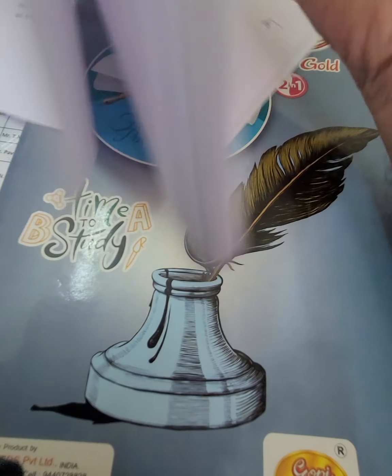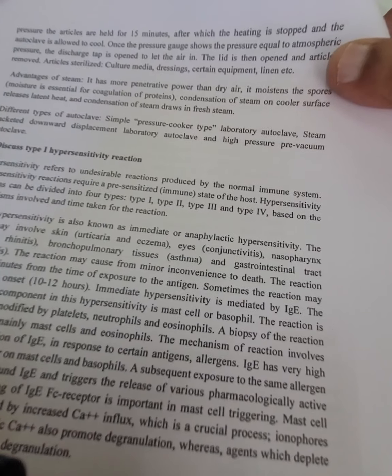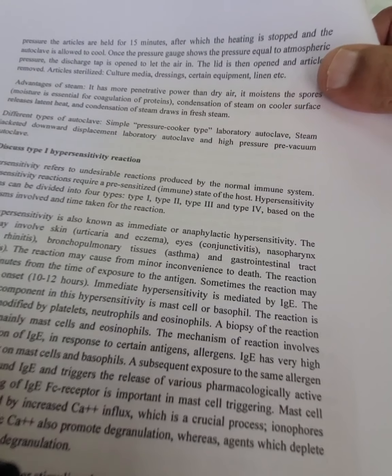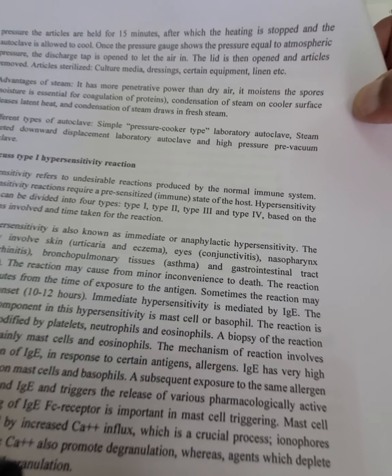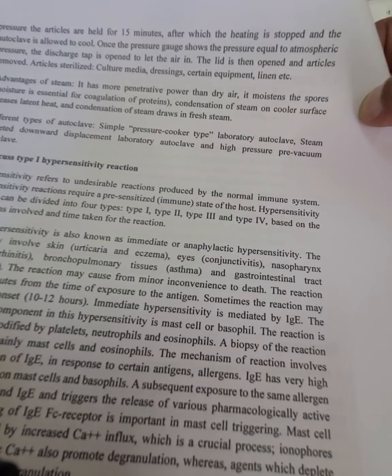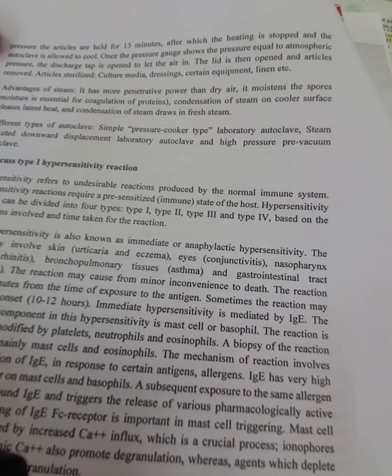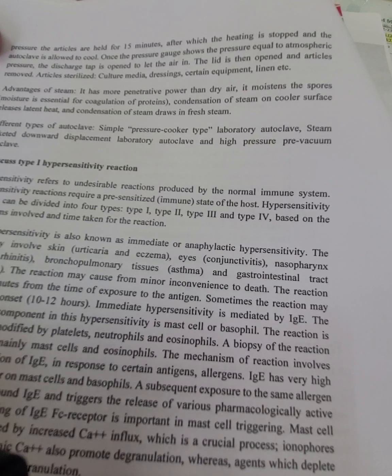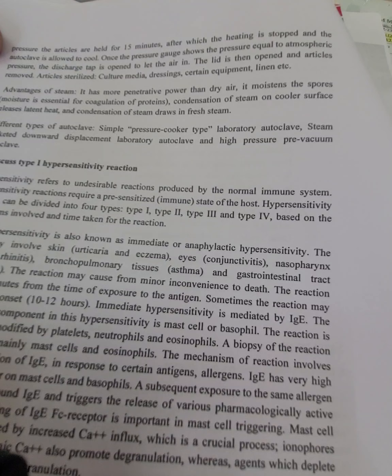Then hold for 15 minutes, and after that heating, the autoclave is stopped and allowed to cool. There are automatic coolers also available, but you should not open when the pressure is high because spillage takes place. And all culture media, articles, rubber catheters, gloves, everything is sterilized.